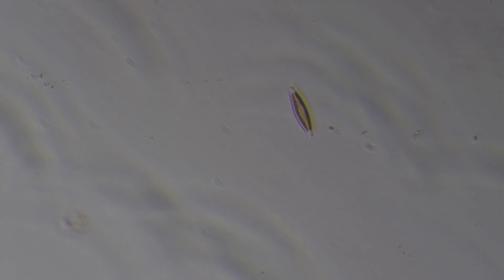This is a pinnate diatom, referring to its shape as a form of classification. And certain pinnate diatoms have the ability to secrete a mucilage which draws them over a substrate. In this case, the substrate is the glass microscope slide.